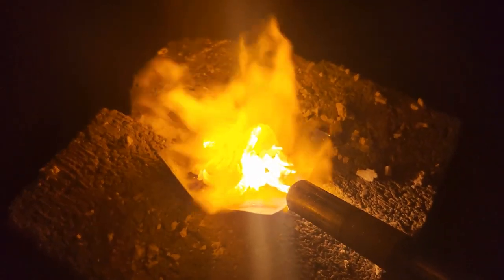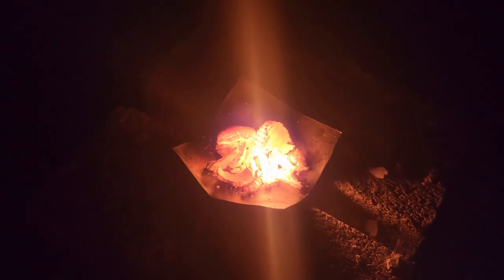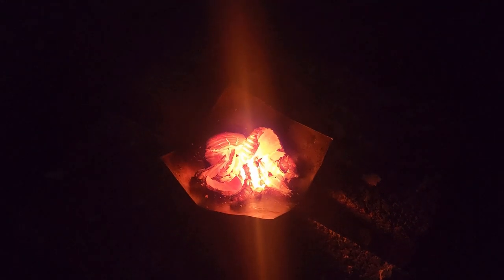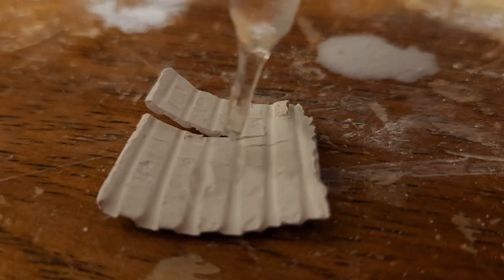One hint that we've got a decent concentration of calcium oxide is that the glow of the hot shells will become very intense. It's hard to tell from the video, but the light coming off these things is actually really bright — that's limelight, which was used for bright indoor lighting before electric lights were common.